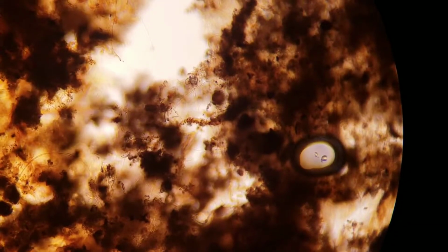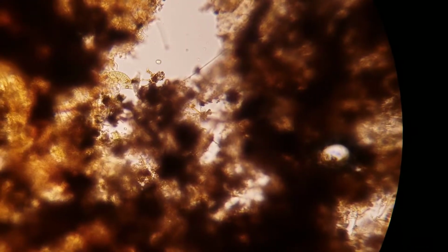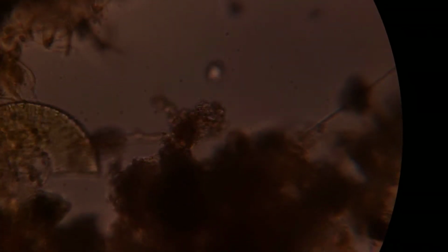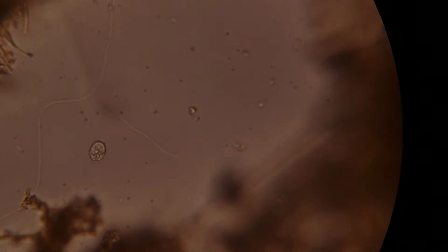It was a Paramecium. There's that gastrotrich. It looks like he's eating something. I wish he would come out. Little fella. I gotta zoom out a bit because I can't see. Cannot see. Focus this in here. Oh, what's that coming out? Is that Paramecium? Come on, hopefully we can see him. Where'd you go? Where'd you go? Come on out. There he is. Come on. Little guy's still spinning.